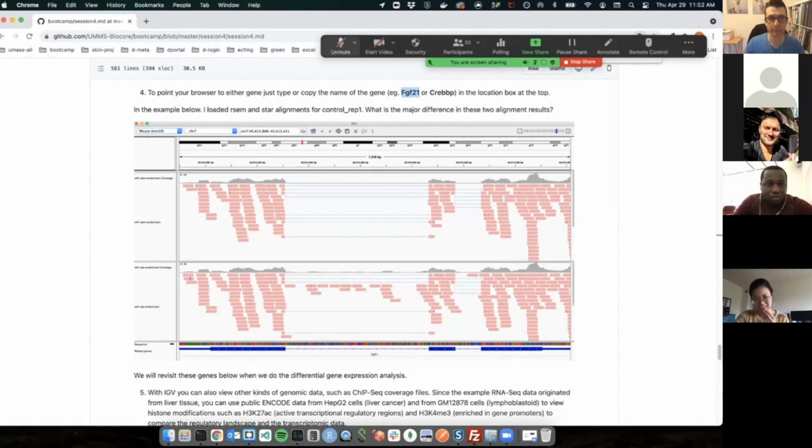Maybe I can tell one more thing here about other genomes or some small RNA-seq sequences you defined, and how you can actually visualize them using IGV. There's a section in IGV or the UCSC genome browser where you can upload your own sequence files as a new genome.